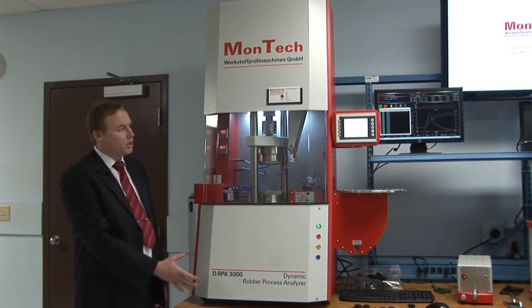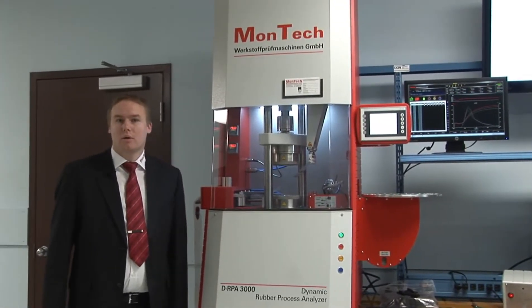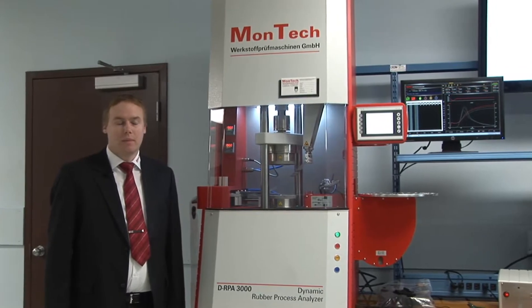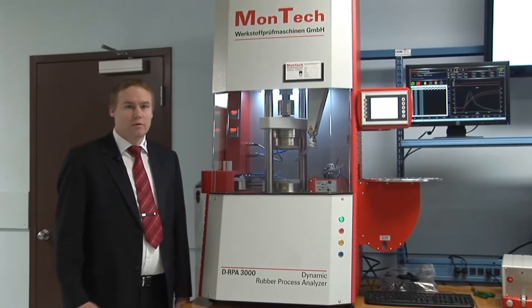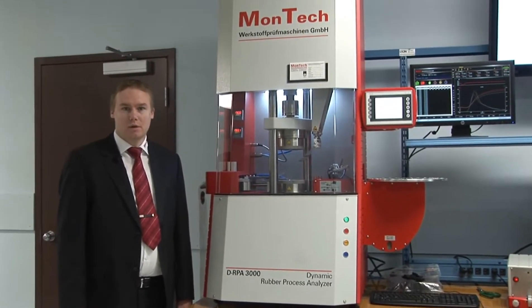Here we see the machine frame itself as well as the software MonControl that comes with the machine. The machine itself is fully controlled by the software — this means all test sequences and test programs are set up in the software.